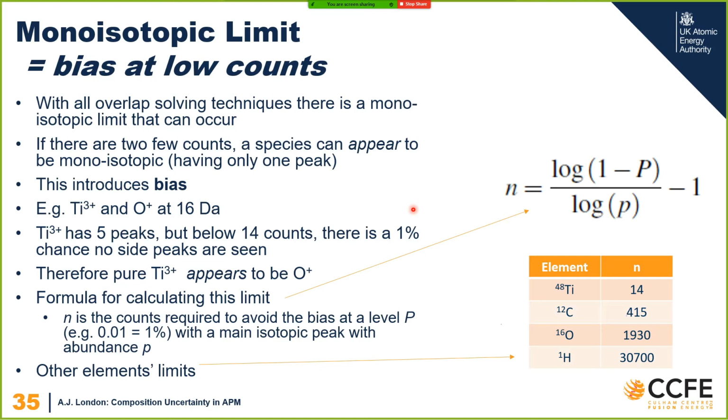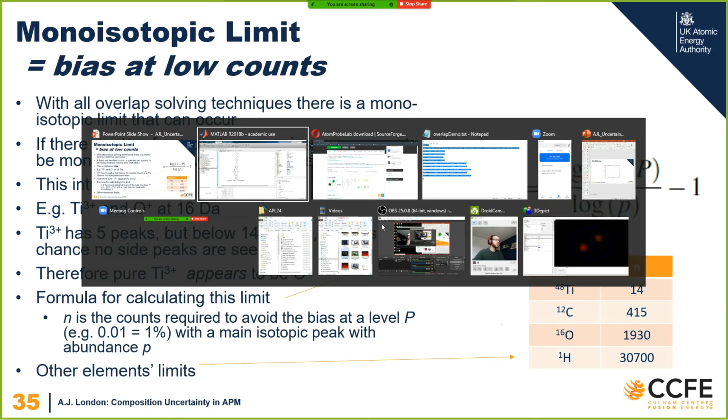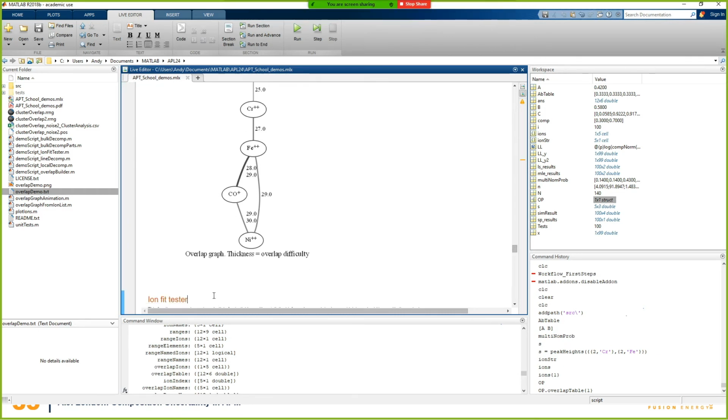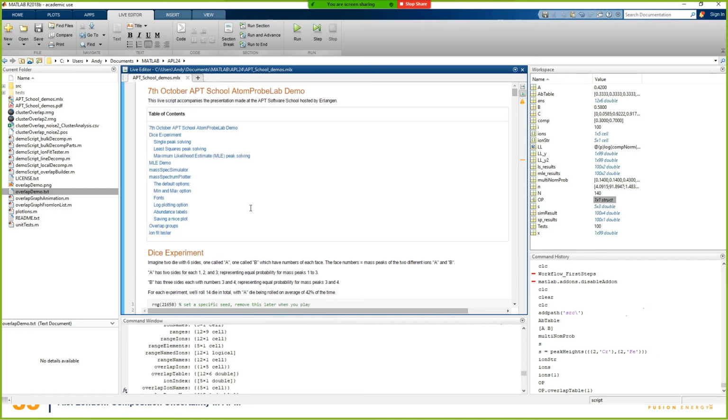But I think before we do that, let's do something a little bit more fun and look at some plotting. Have I totally lost everybody, or are you still with me? I'm trying my best. That's great. It should get a bit easier from here on.